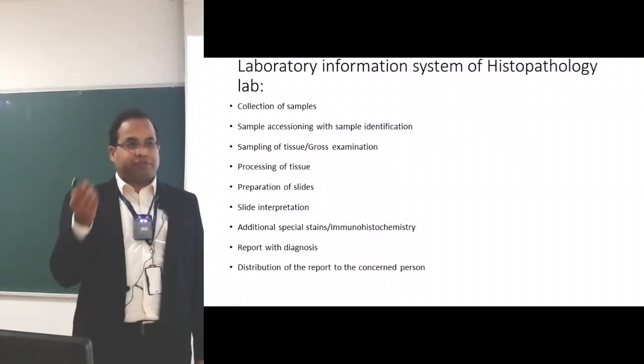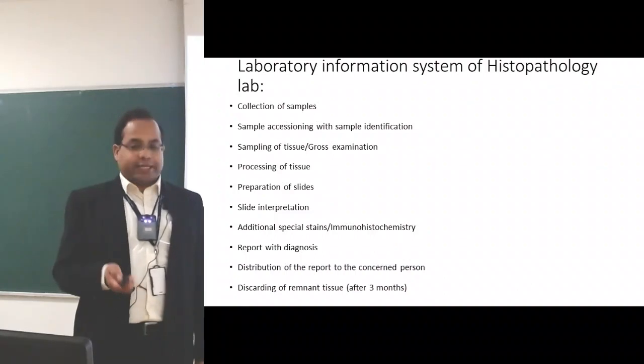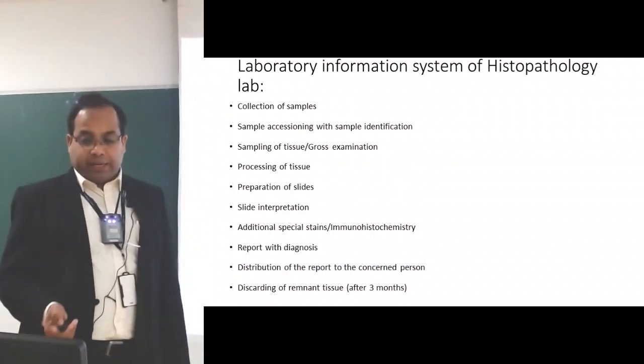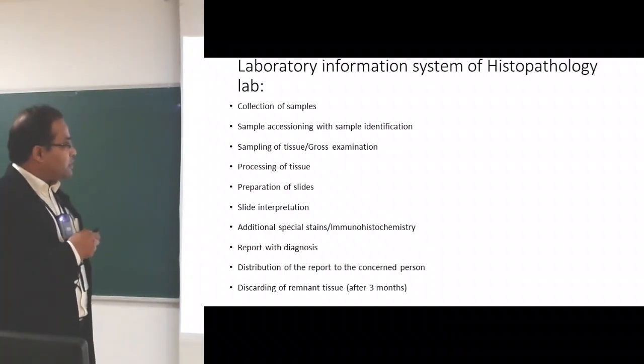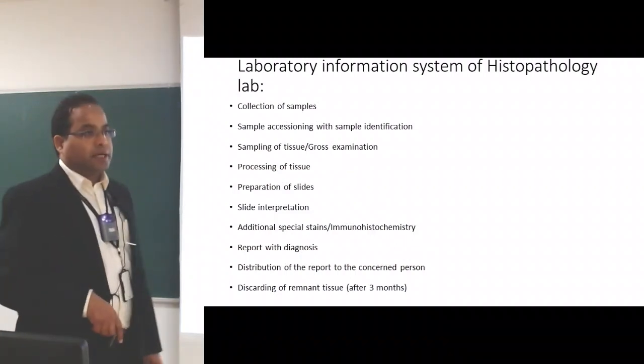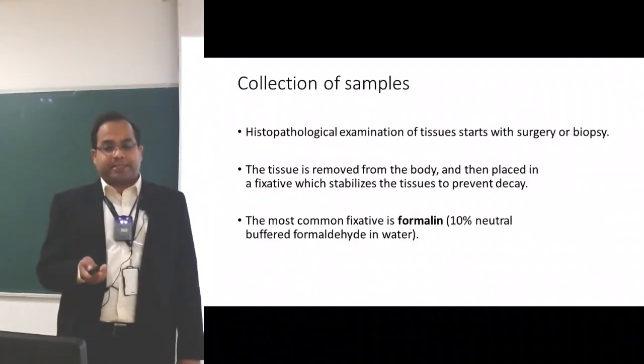A laboratory information system or the workflow captures all this. So the samples come in as soon as the biopsy is done, and then it goes away after 3 months.